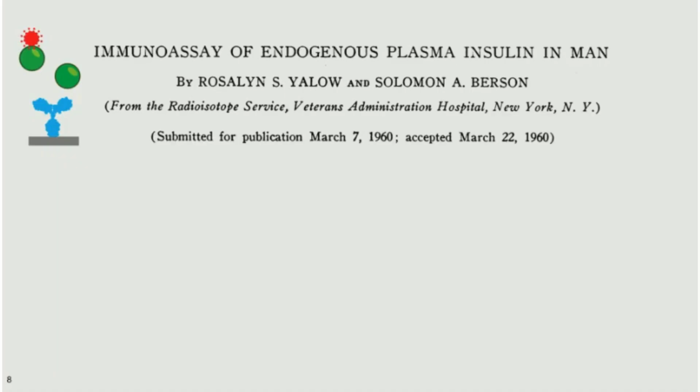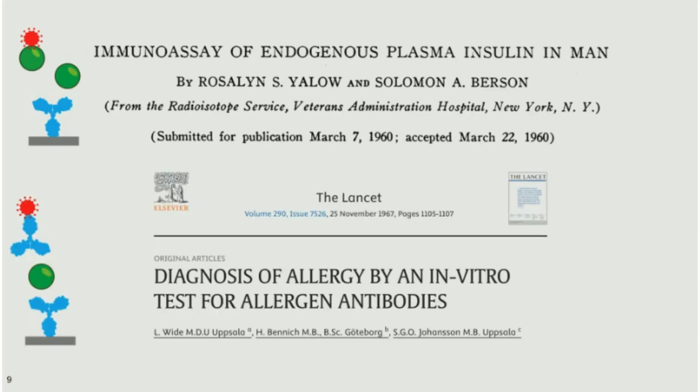But I wanted to bring up this old paper from 1960, the Nobel Prize-winning paper from Yalow and Berson, where they demonstrated the radioimmunoassay and the possibility of detecting protein with a competition assay, a single antibody. In my mind, that wasn't such a revolution, but I think what came later from my home city, Uppsala, was the sandwich assay shown below. So you have a capture antibody, you add your protein, and then you have a detection antibody. And now you get much better specificity, and that has been dominating how we measure protein, although there is more competition lately.